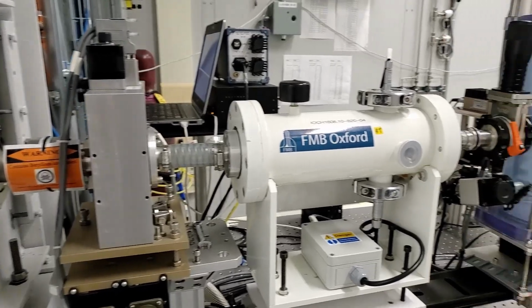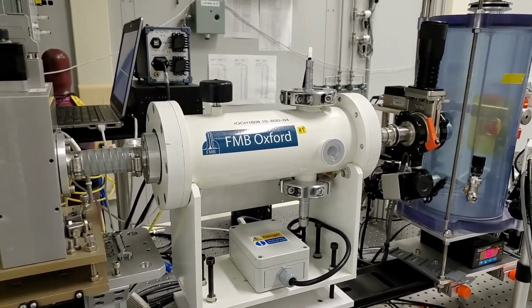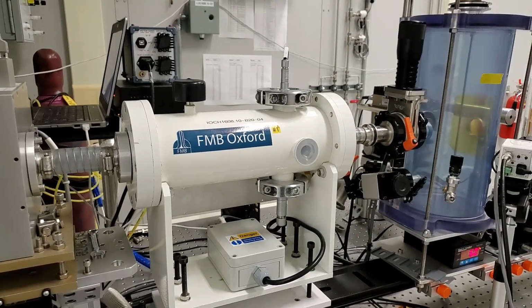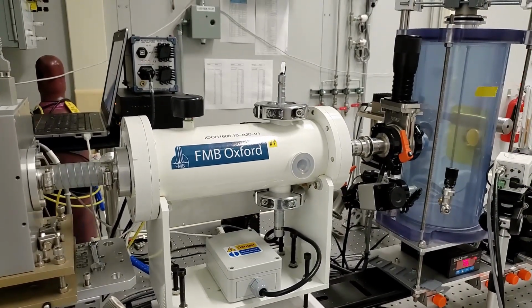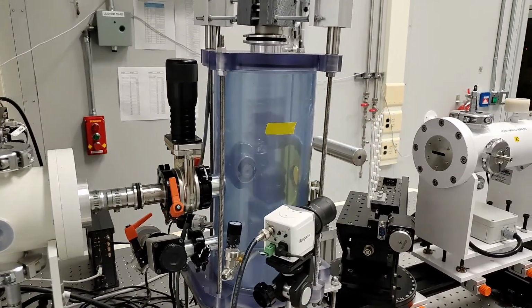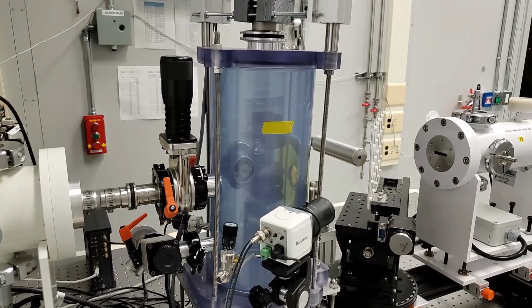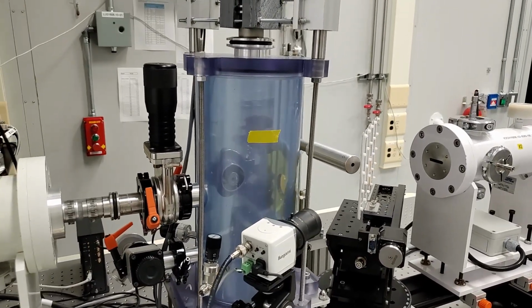Next, there is an ion chamber, used to monitor the intensity of the light being supplied by the beamline. It works by using high voltage to collect the ionized gas molecules produced as the X-rays pass through. Next, we have a vacuum chamber that samples can be mounted in when needed. Removing the air around a sample can be beneficial for certain types of measurements.